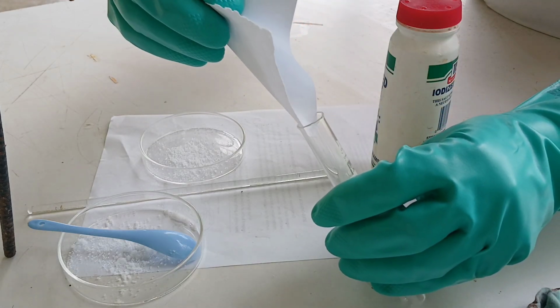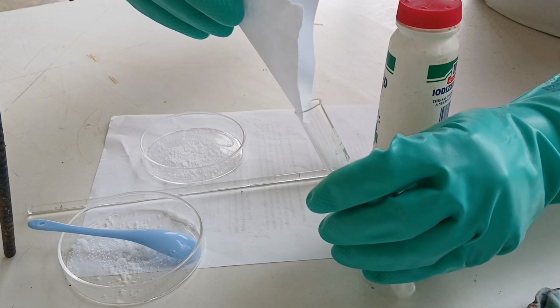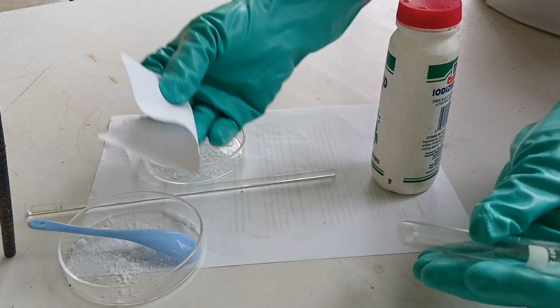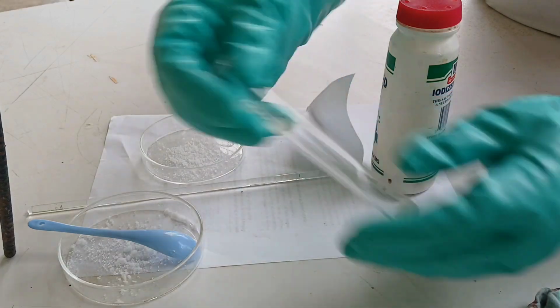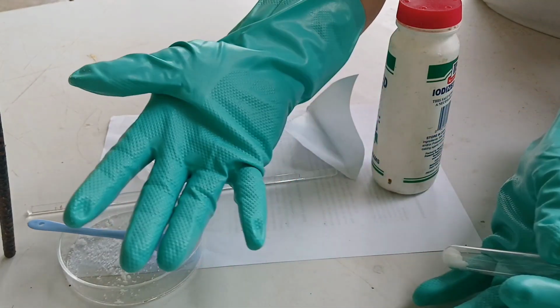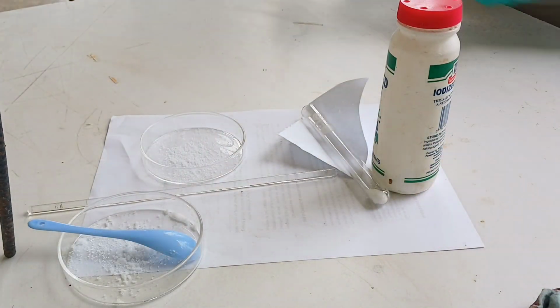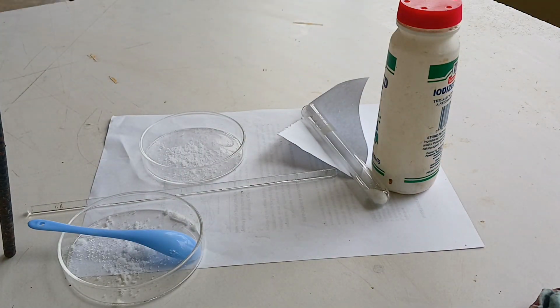So just like that, tilt and slide it down to avoid spillage, no spillage at all and flawless. That is how to transfer solid chemicals to an open mouth container and a narrow mouth container.